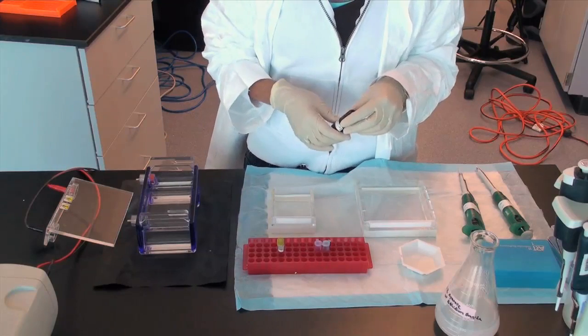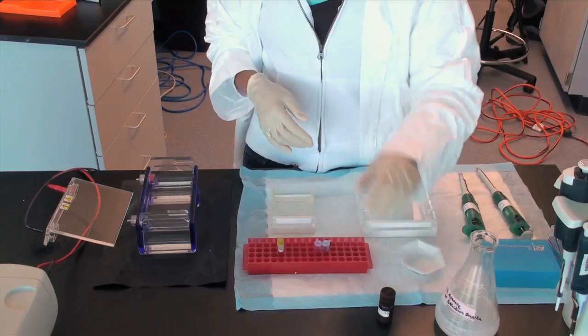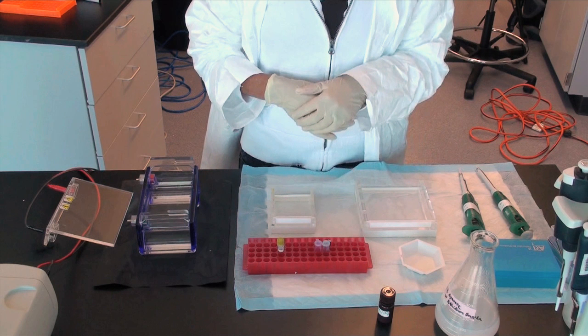Remember, EtBr is a mutagen, so be careful not to spill any on yourself or the lab bench. In addition, place the used pipette tip in the correct waste container.